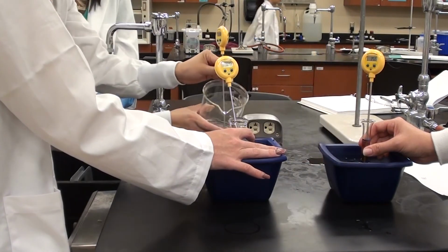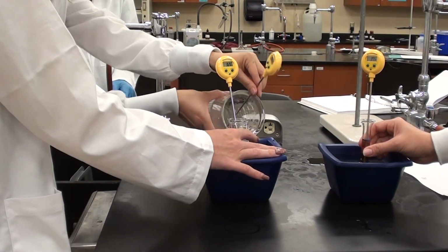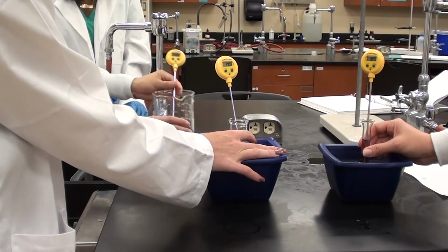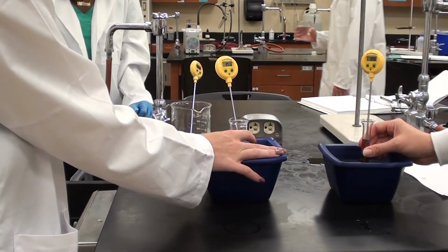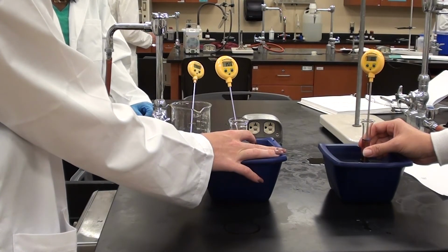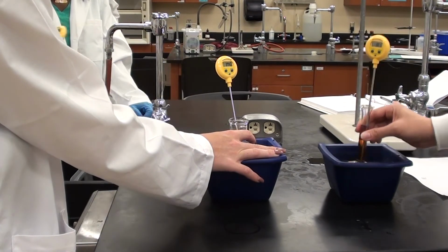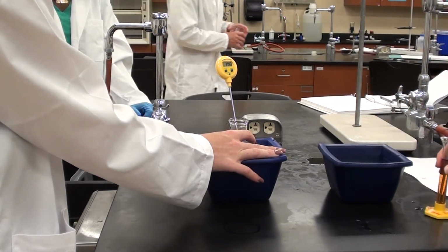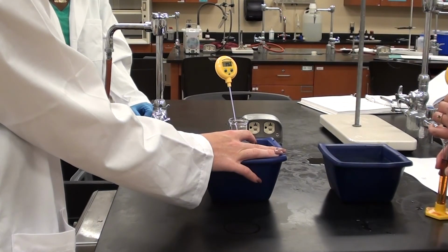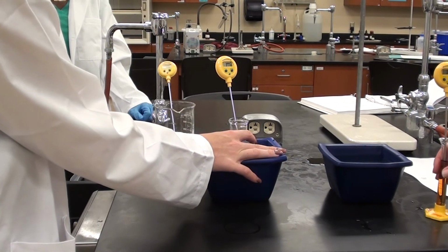Okay, that'll do on the iodine. The iodine's going up a little faster now. So it looks like we're at, is it about 38 on the iodine now? Okay. I'd like you to pull the iodine out of the solution for a little bit. There we go. And keep an eye on the temperature. See if you can manage it so it stays at the same temperature as the other solution.